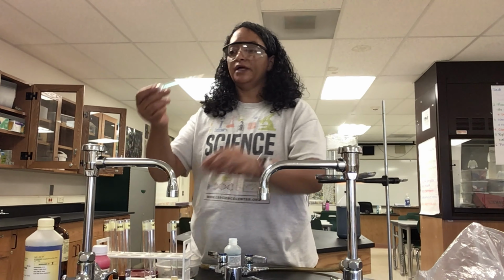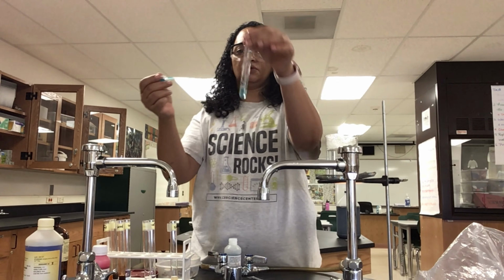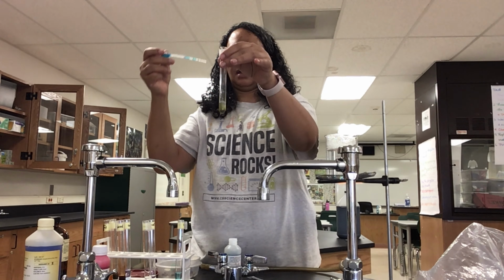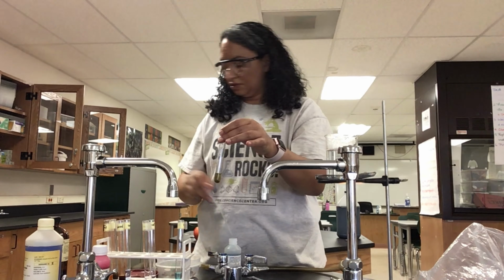Alright, so it's a blue color, kind of like our previous one. So I'm going to put some in there. So we got a nice blue color there. And then I'm going to put some in the seed one as well. Okay, so it turned to kind of a funny milky green color. Squirt the extra back in there.